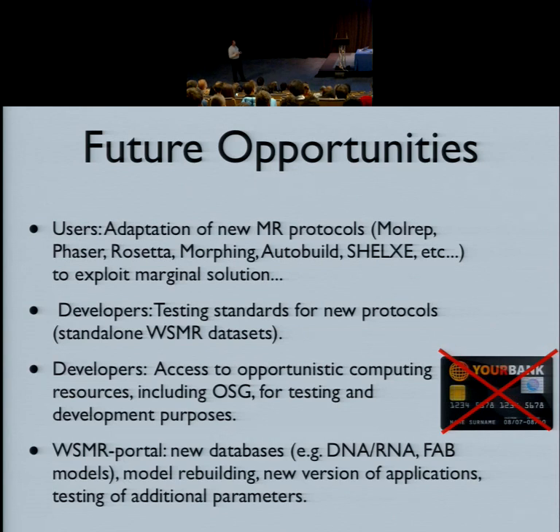For developers, I think it would be worthwhile to think about the standard test sets which are used by the community to really track the progression of the methods. To check, for example, with this domain that I show, we can only get right now 12 out of 200. With time, are we doing better? And by using different tools, can we really push the boundaries? Because right now, I think especially from the user perspective, there's a bit of confusion, and with so many methods, they clearly work for individual particular cases, but the sense of what is really the robustness of them overall, I think it's something that is currently missing.